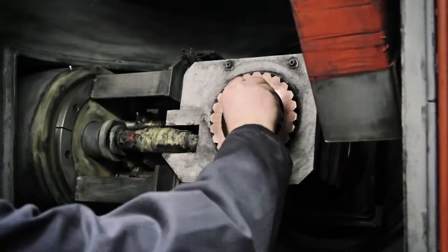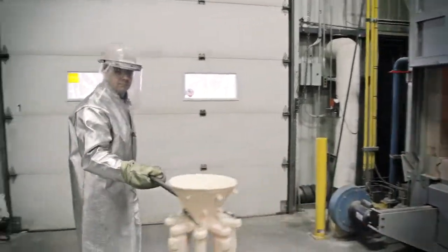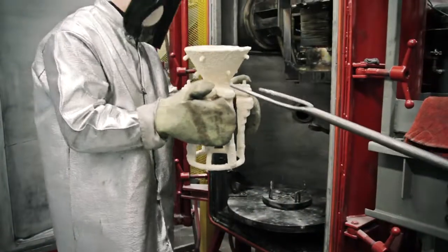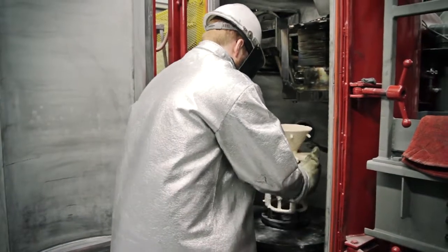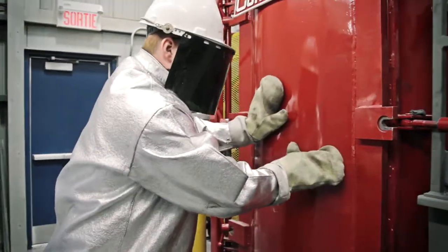The charge is weighed and placed in the crucible. Then, the mold is removed from the preheated furnace and placed in the vacuum chamber. The door is closed and the vacuum is activated in the chamber.